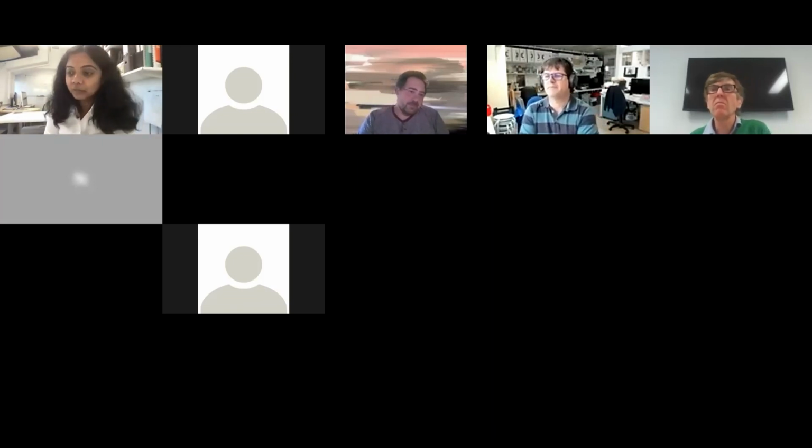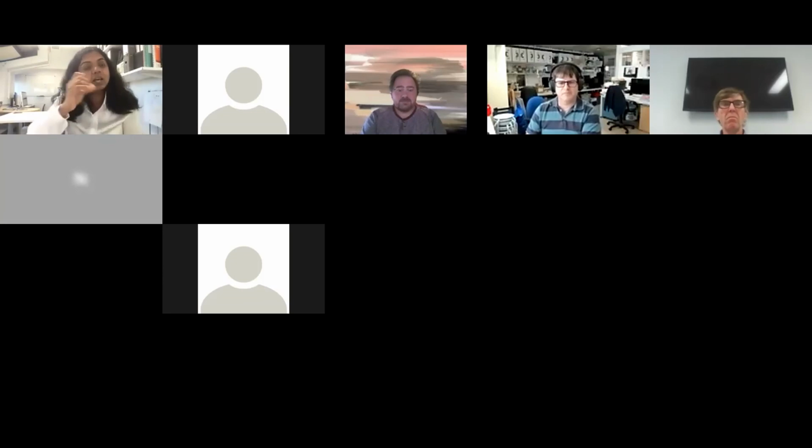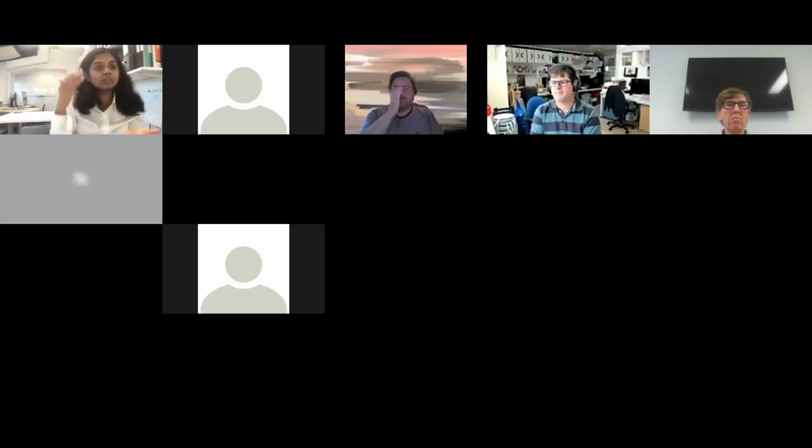So we tried to keep video rate. It's the first one. So we have to think slightly differently from how we look at a conventional imaging system. Usually we think of it as, is it 10 slices for this distance? But here the control is not in terms of slices. The lens is continuously changing its focal length, and the camera cuts out at some point. So that's how you get a semi-still image.